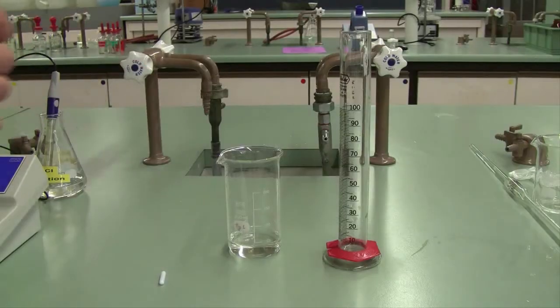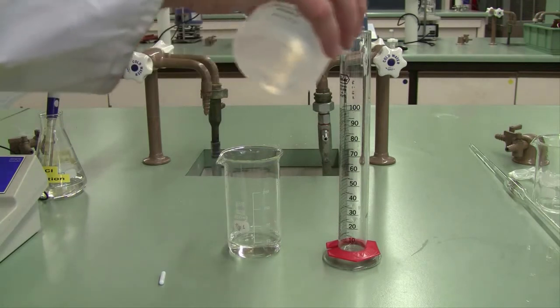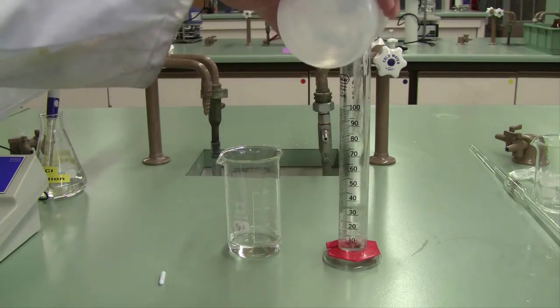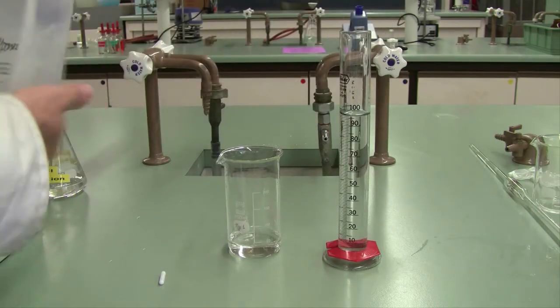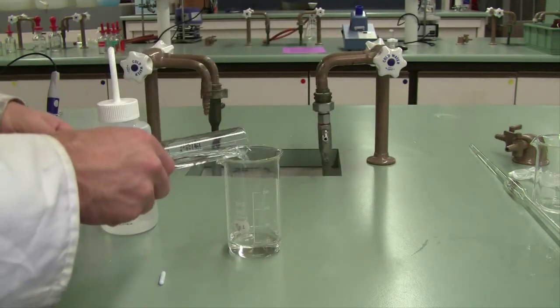Then using a measuring cylinder, add approximately 100 ml of distilled water to that ammonia. This isn't to dilute the solution, it's to bulk it up to ensure that your pH electrode is covered at all times. The addition of this water will not affect the number of moles of ammonia in your sample.